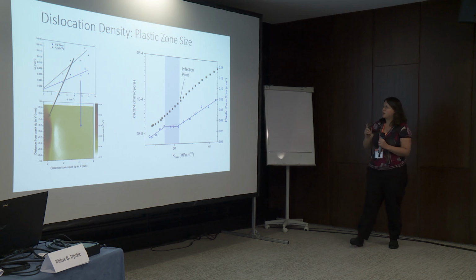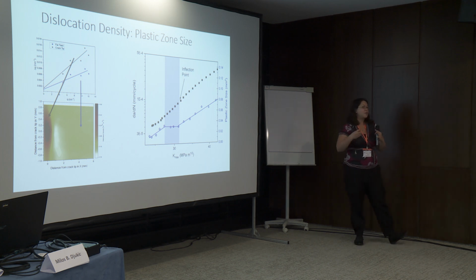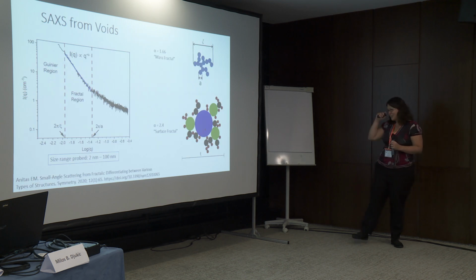I forgot, since this is not my talk, there's one more bit in here. We wanted to see if this region compares to anything that's going on in mechanical testing. So this is the fatigue crack growth rate data. And what you can see is this plateau region starts right when you get an increase in the slope, and then it ends when you get this inflection point. It's subtle, but there's definitely an inflection point there. So there's something happening in the mechanical data that also corresponds to this plateau in the plastic zone size. And so we want to investigate that using the small angle X-rays.